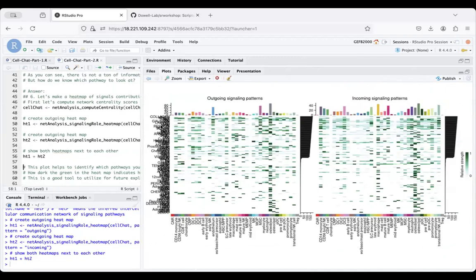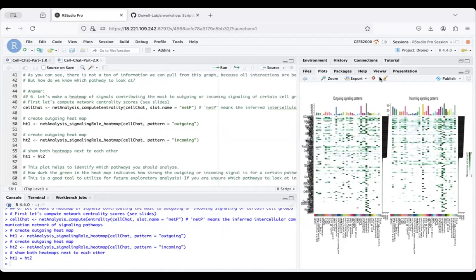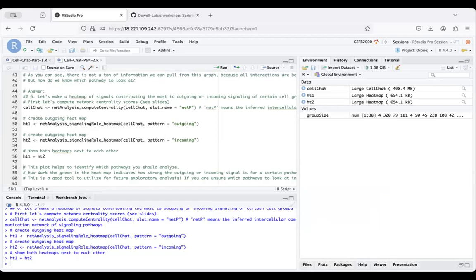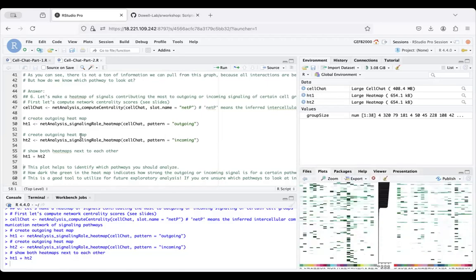And right here, you can see all the pathways are on the left here. It looks crazy because we had to condense the image to just our little tiny plot portion of this RStudio environment. However, you could download this image and actually look at the different cell types by blowing it up. All right, but for today, since we are working with Down syndrome data, I guess we might have to leave this like this for now. There we go. All right.